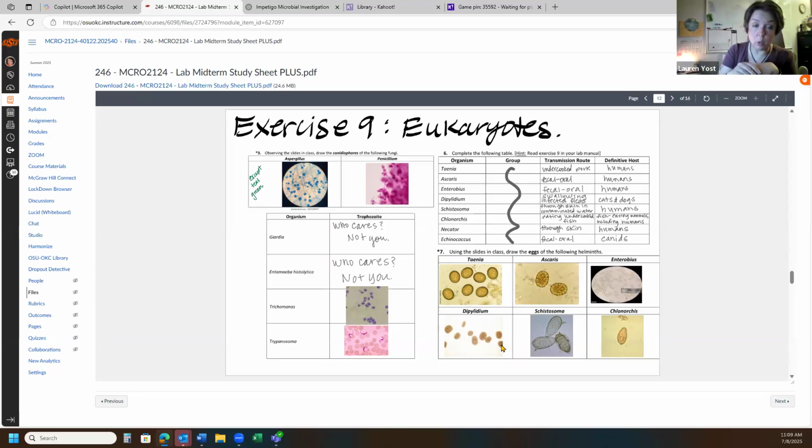If you're not understanding where I got 100x and that became 1,000 times, then you should look into that as well, because you do need to know that for the exam, calculating the magnification. Your eyepiece, where your virtual image is being made, is 10x. The light travels up through the specimen into the objective lenses. We rotate our objective lens on the nose piece, right? The nose piece is the part that rotates. The lens itself is the objective lens. And so we have the 4x, 10x, 40x, and 100x.